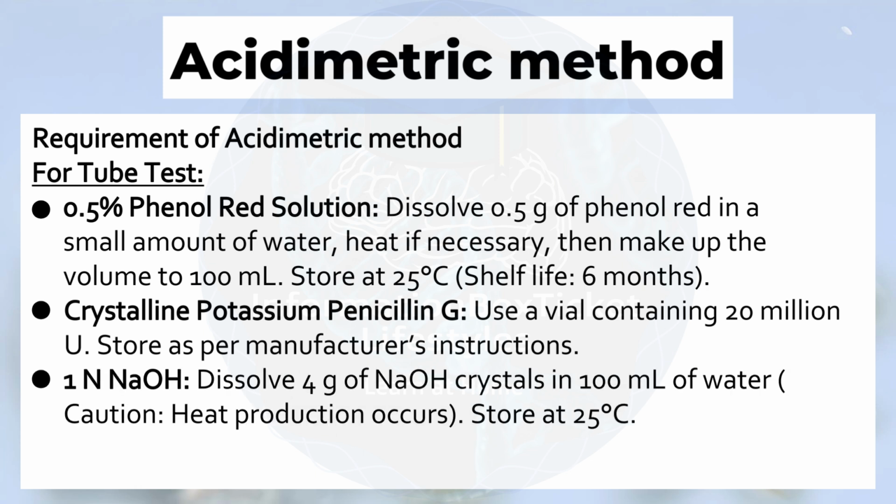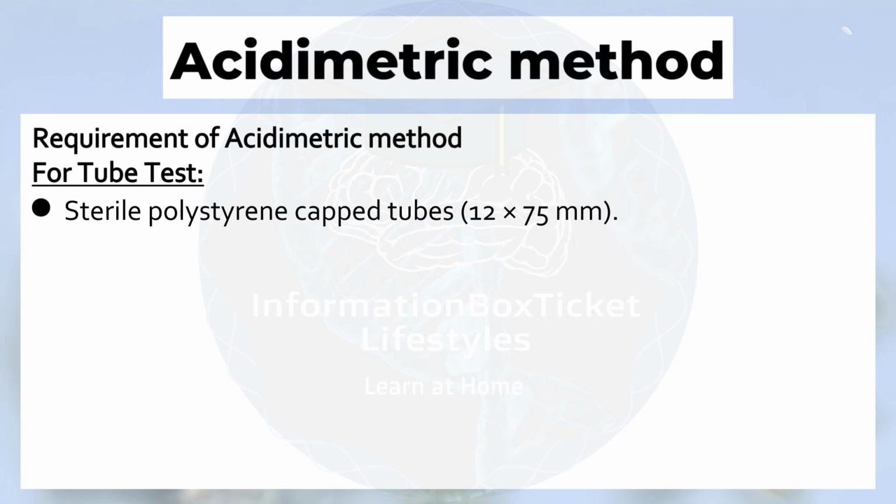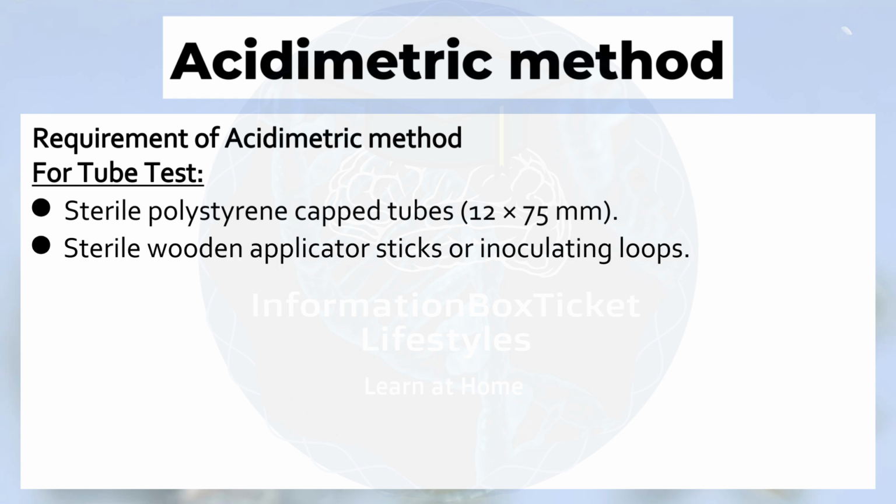1 N NaOH: dissolve 4 grams of NaOH crystals in 100 milliliters of water. Caution, heat production occurs. Store at 25 degrees Celsius. Sterile 1 milliliter and 10 milliliter pipettes with a pipette bulb. Sterile polystyrene capped tubes, 12 by 75 millimeters. Sterile wooden applicator sticks or inoculating loops.